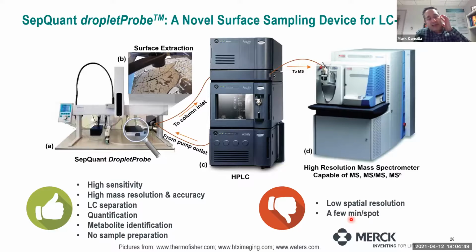Yes. Caprioli's lab at Vanderbilt has one, and we've been using their methods. And you should invite Bing Ming in the future to this discussion. She's doing tissue, she's laying trypsin down, following a lot of the methodology that Caprioli has done in his lab. I actually had it in this discussion, but I took it out because I didn't have enough time. So you can do trypsin-based proteomics from all these tissue sections, and she does it on all different tissues. What we found is it definitely works. It's not super sensitive. You don't go too far down in the proteome. You're getting a lot of the high-level proteins, but it definitely works. And Bing Ming has a lot of good data on that.